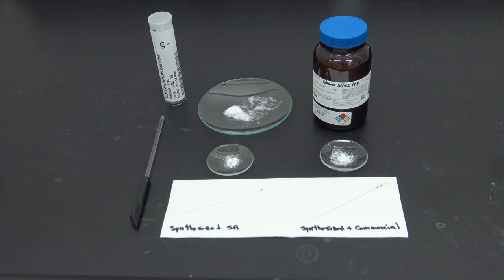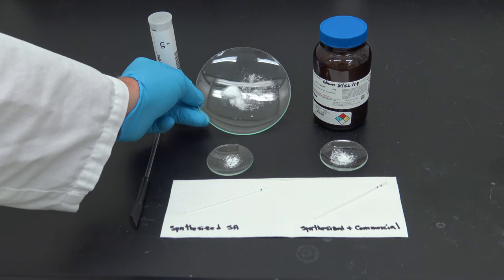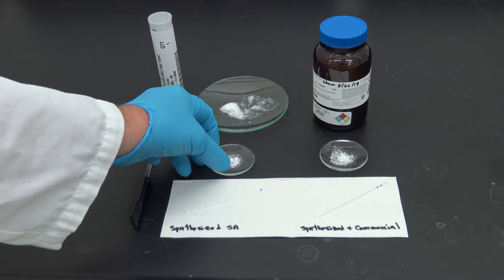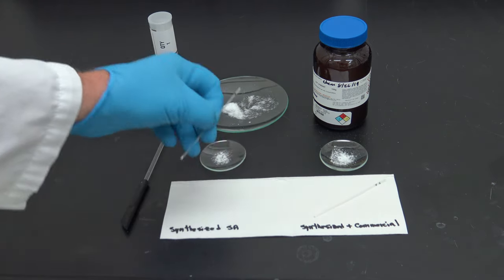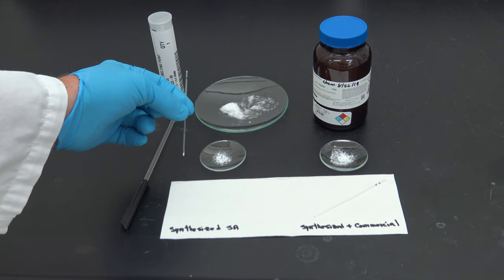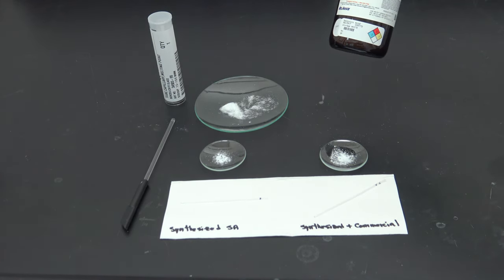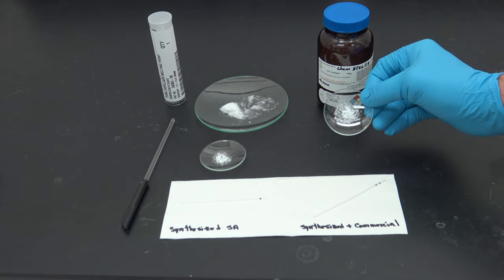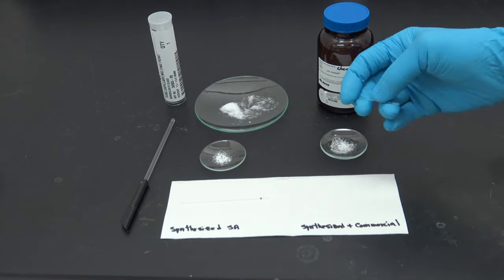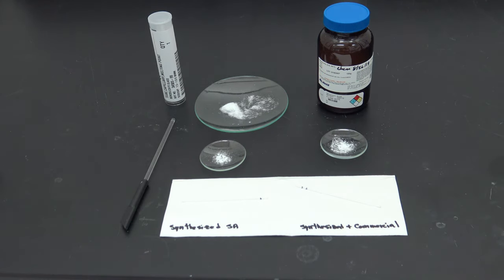I have prepared two samples for melting point determination. I've taken our synthesized salicylic acid, put a small amount on a small watch glass and ground it up using my stirring rod. I've then put a small amount into a capillary tube. I've also taken some commercial salicylic acid, mixed it with some of my synthesized salicylic acid, ground it up, and put it in a capillary tube also. So now I'm going to take both these samples over to the melting point apparatus, and we're going to determine the melting point range for both of those.